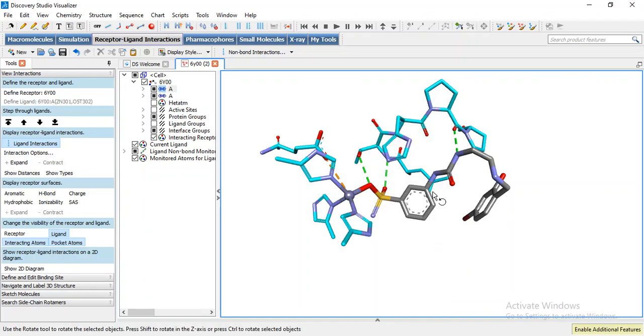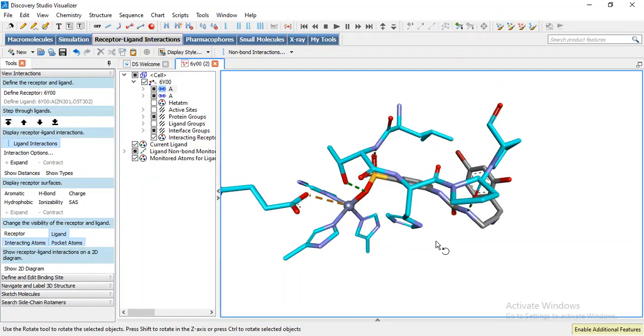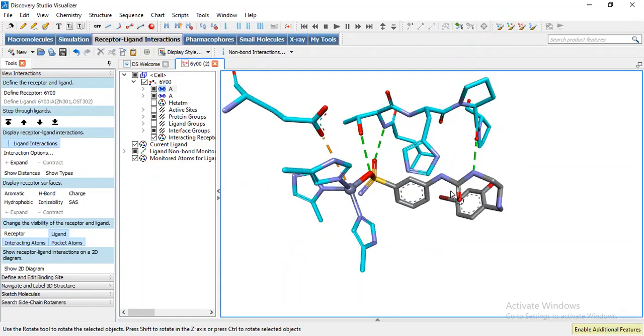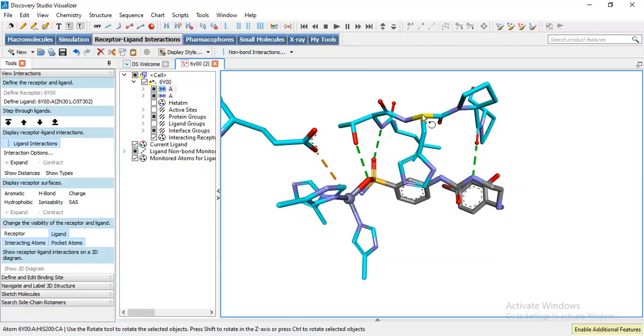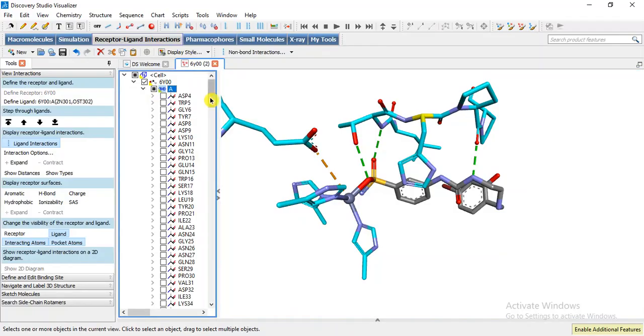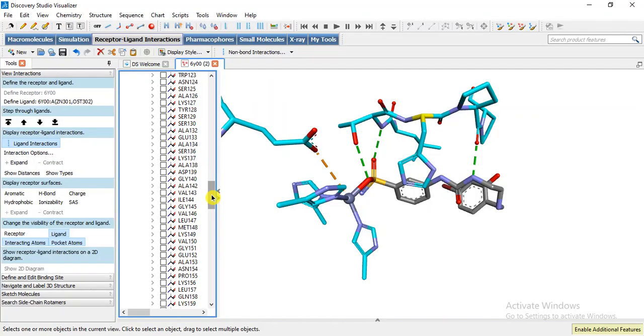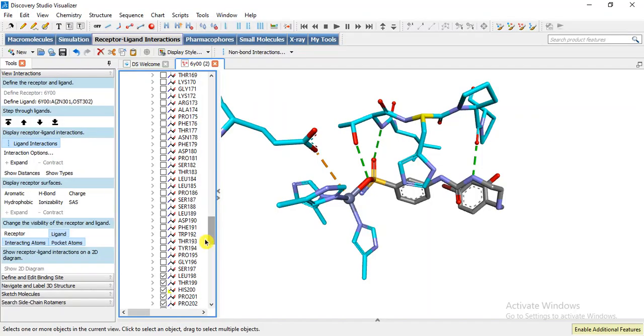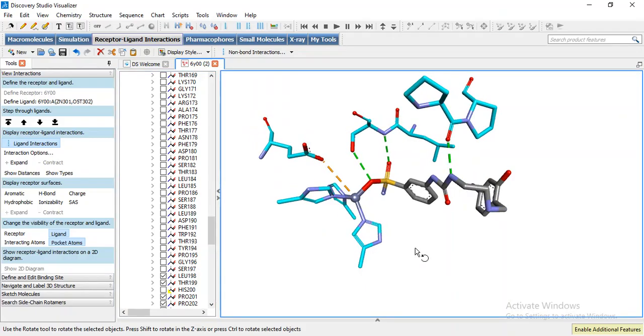Now we can observe what kind of residues are present. We can label them but this is a histidine 200 and it has no interaction with our ligand so I am going to remove it. I have removed that.